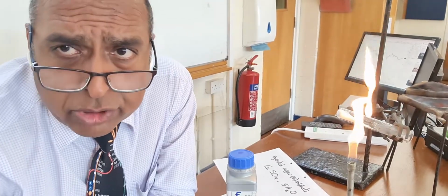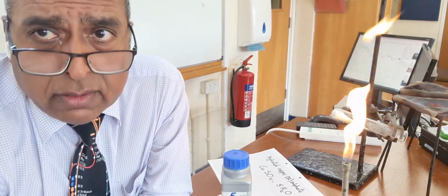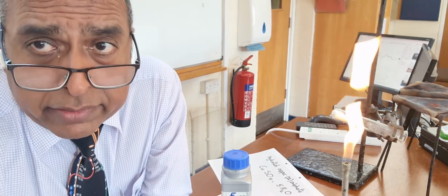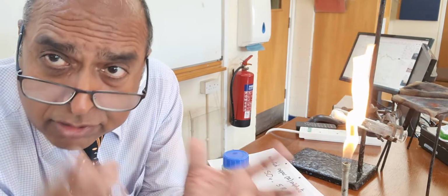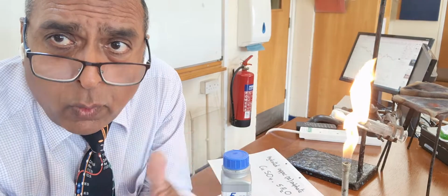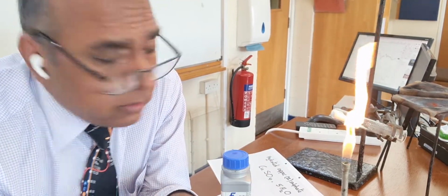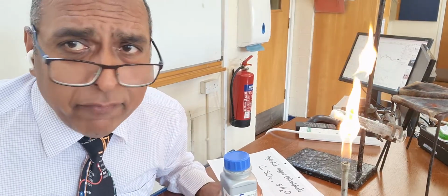But there are many salts where the water of crystallization is present and they're white. In the hydrated form they're white, and when they're anhydrous they're white. So a lot of them you don't notice it's there. With copper sulphate, because of the two different colours, the blue and the white, it's quite visual, and therefore we demonstrate it. So I just want you to know it's trapped water, but it's not random.